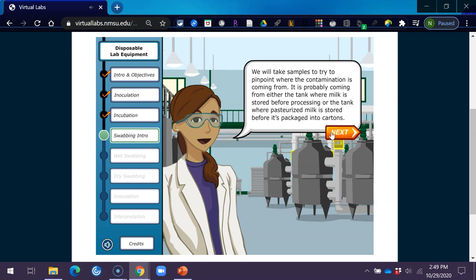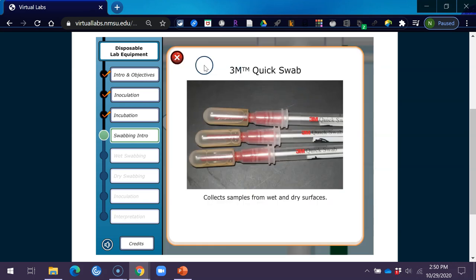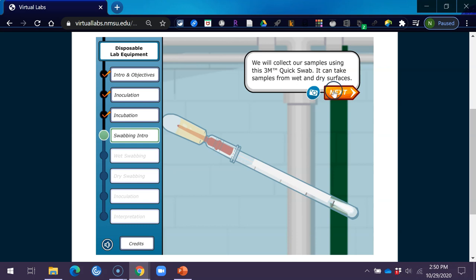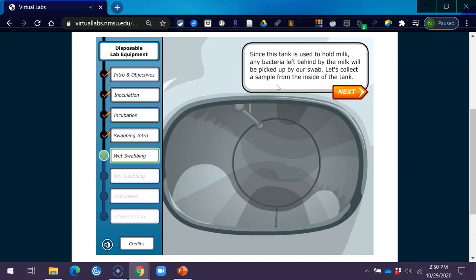We will take samples to try to pinpoint where the contamination is coming from. It is probably coming from either the tank where milk is stored before processing, or the tank where pasteurized milk is stored before it's packaged into cartons. We will collect our samples using this 3M quick swab, which can take samples from wet and dry surfaces. Before milk is pasteurized, it is held in this refrigerated storage tank — let's collect a sample from the inside.